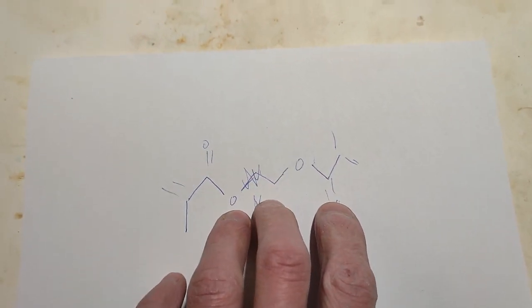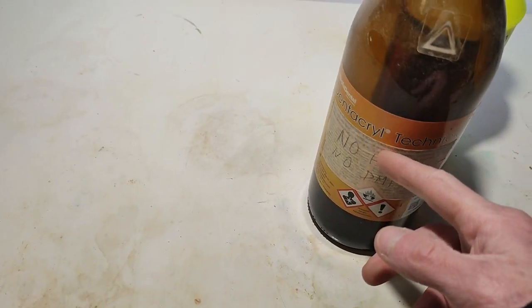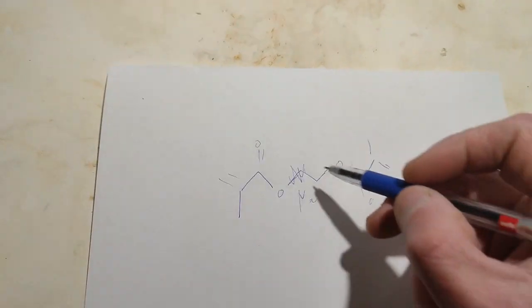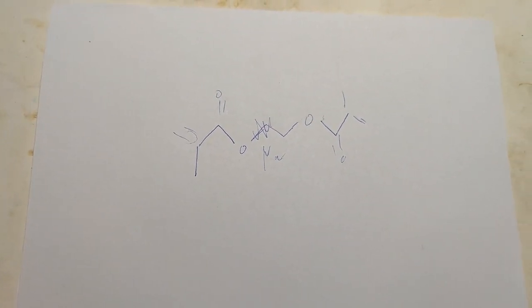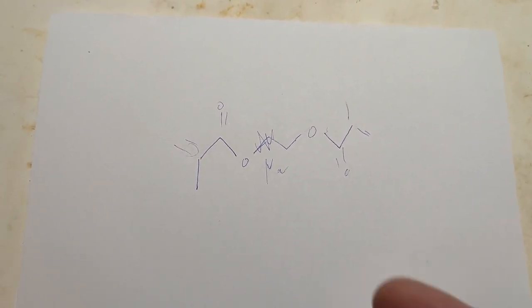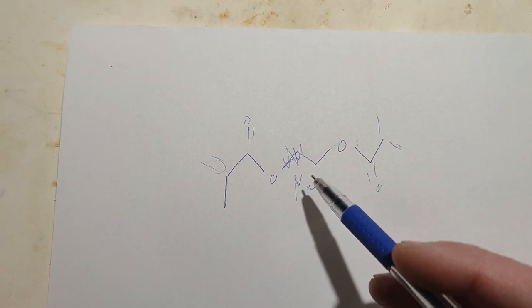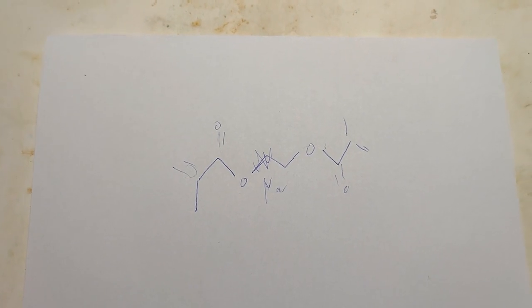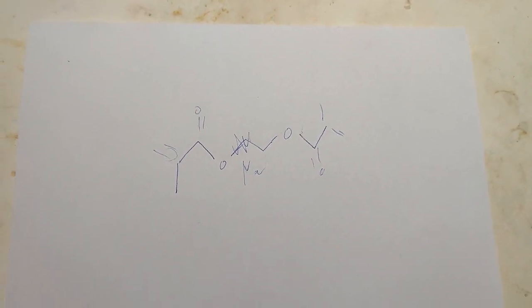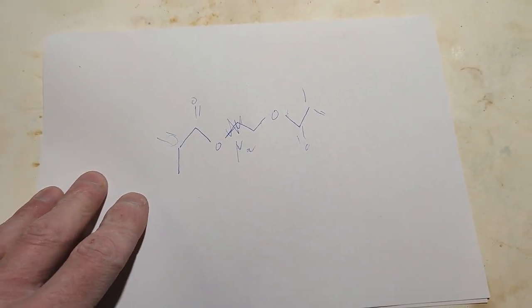So I have done this thing already, and it is pretty simple. You basically mix some methacrylate with some sodium hydroxide, stir it at relatively low temperature, because this double bond is a little bit ADHD, so you don't want it to polymerize, and this complicates things a lot, actually. I think I was even successful at forming this whole molecule, but I am not exactly sure about it. I think I was, because it smelled really nice. Anyway, let's get into the stuff.